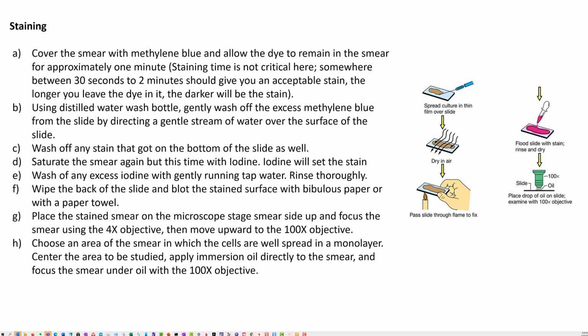Wash off any stain that got on the bottom of the slide at the time, so you can flip that around and do that. And then you make sure the iodine is the mordant for the gram stain.